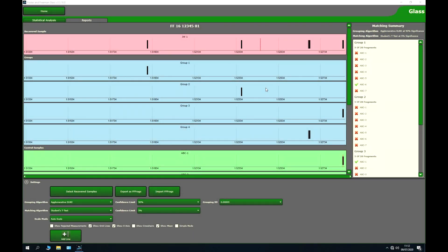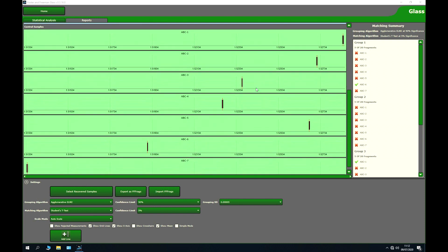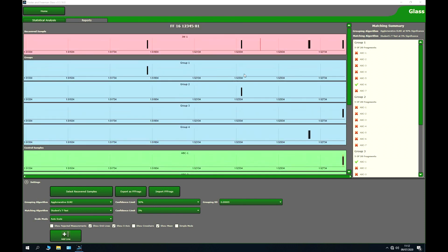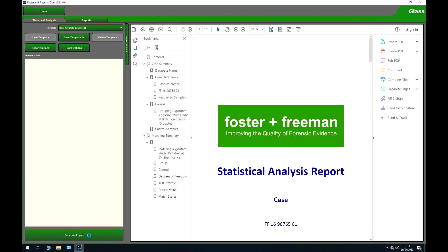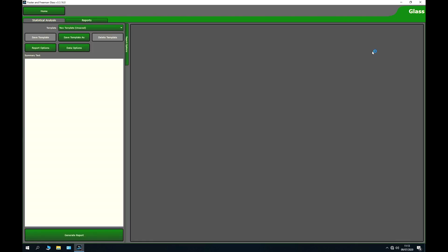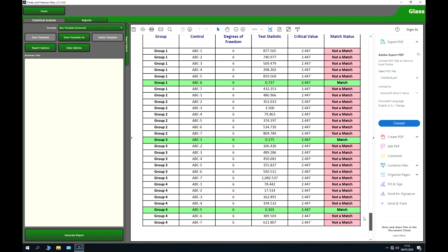Here we have a different example of a much more complex case with a lot more variety in the recovered samples, comparing those to a larger set of controls. The recovered samples are broken down into different groups, and on the right-hand side red crosses and green ticks indicate the matches calculated by the software. Generating a report and skipping to the summary clearly shows where the software has determined a match from the recovered fragments to the controls.